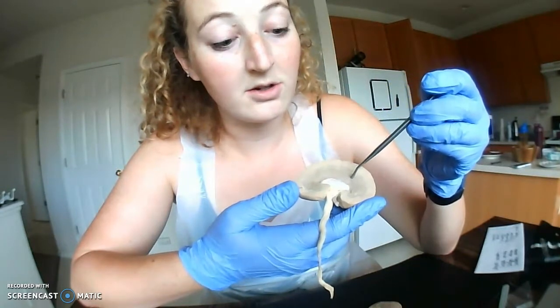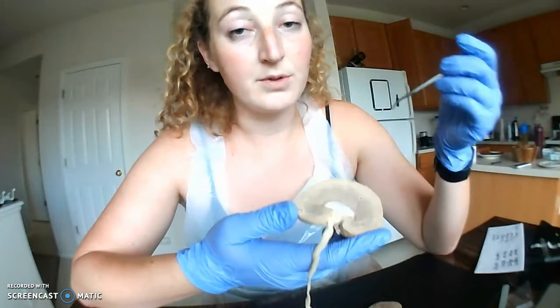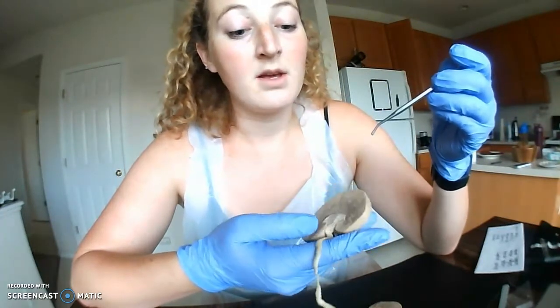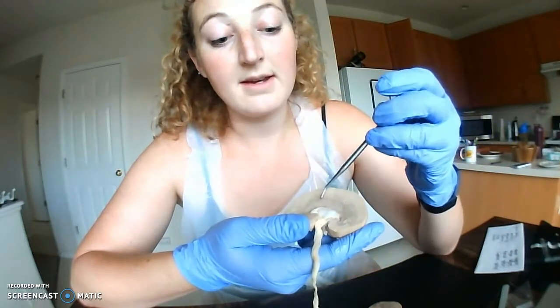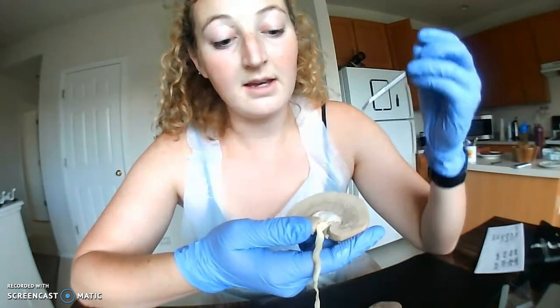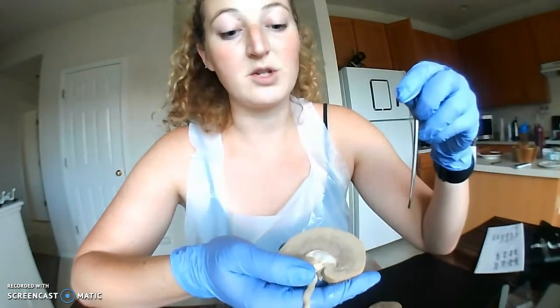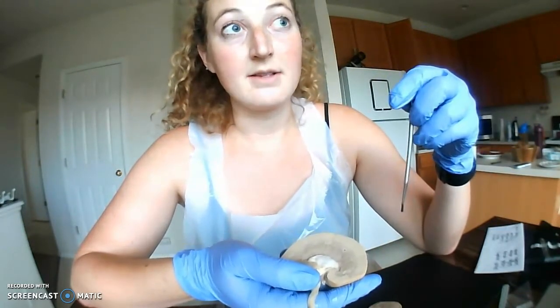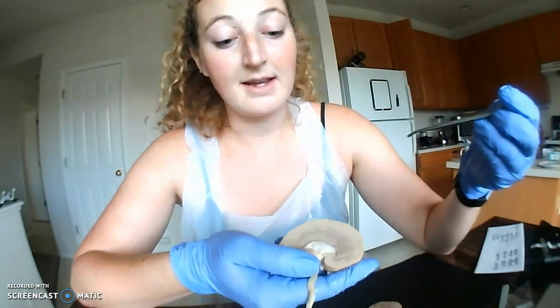You can see the color change. So this darker section right here is the renal medulla. From a nephron point of view, this is where that descending and ascending tubule is. So a lot of reabsorption as far as water and different nutrients, glucose, amino acids, things like that.